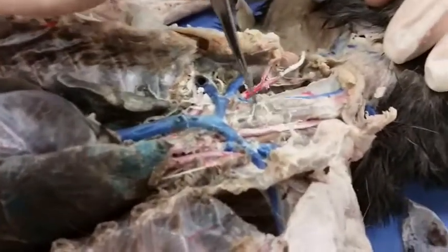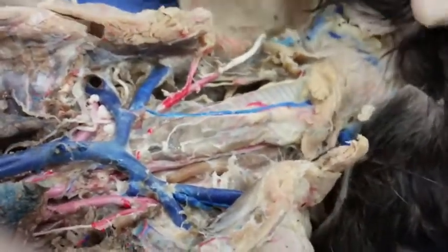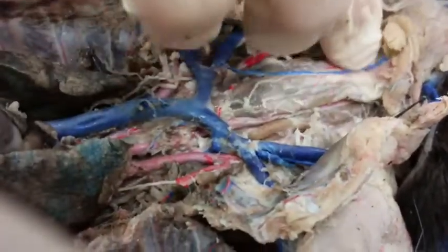Okay. We are looking for the thyroid gland, which is not very easy to find, according to Dr. Hendry. It is theoretically right along in here. However, ours may not be visible just because these cats aren't always the healthiest, and so the thyroid usually suffers thanks to it. But the thyroid should be right about here. Moving up in order. And then obviously there's the trachea. You can tell because when you run your hand along it, it feels like plastic almost. It's very, very unique feeling.